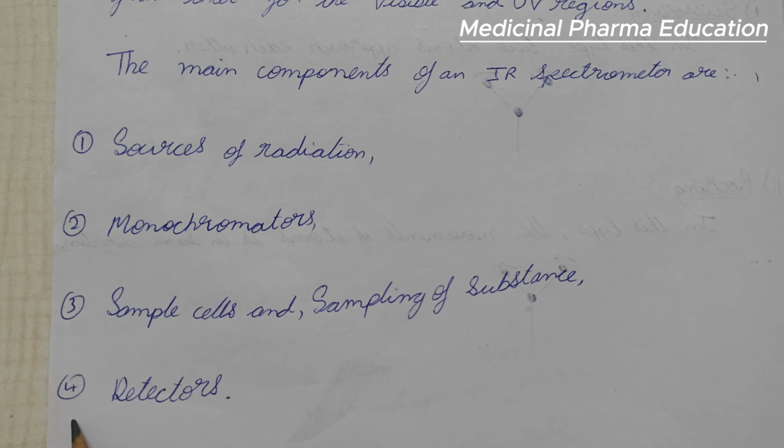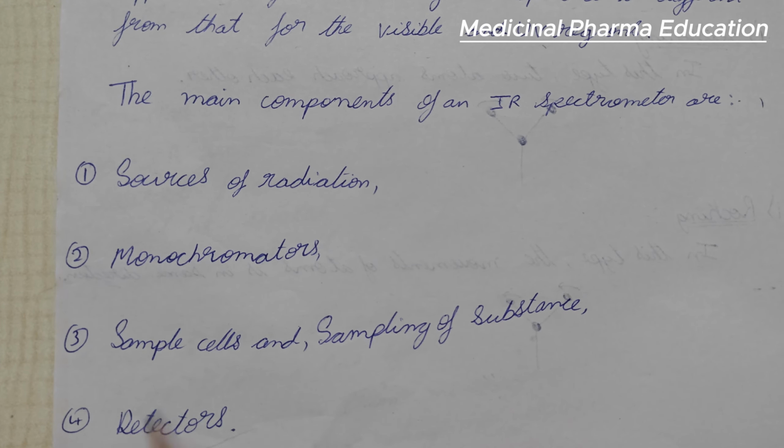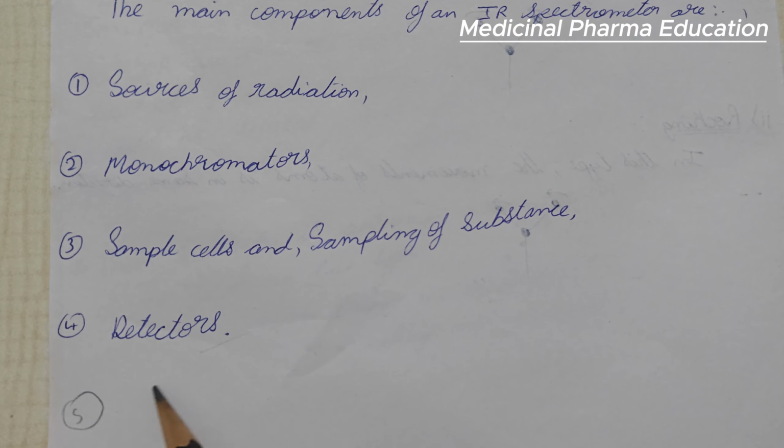Then we use the detectors, and in every detector there are readout devices. The fifth one is readout devices, you can just write it.